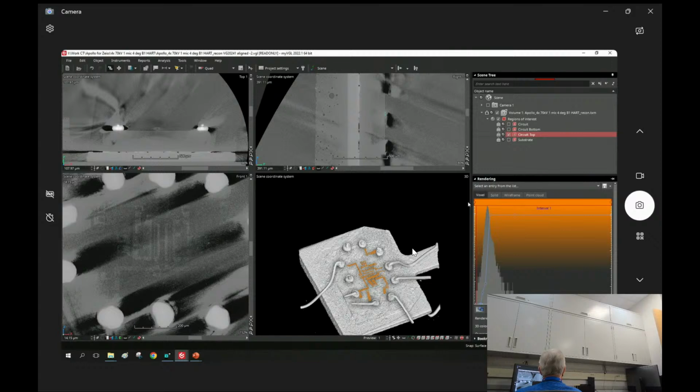If I have a process that's taking multiple machining steps and combining them into one, I can't cut it open to find out what went wrong or what went right. I don't know that I've made a good part or a bad part until after I've done some sort of non-destructive analysis on it to make sure everything's where it's supposed to be and all the voids are open and not filled with the powder.